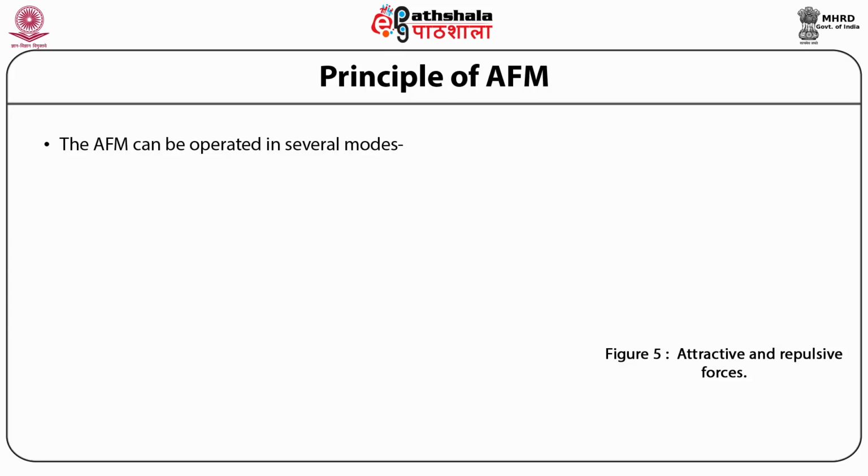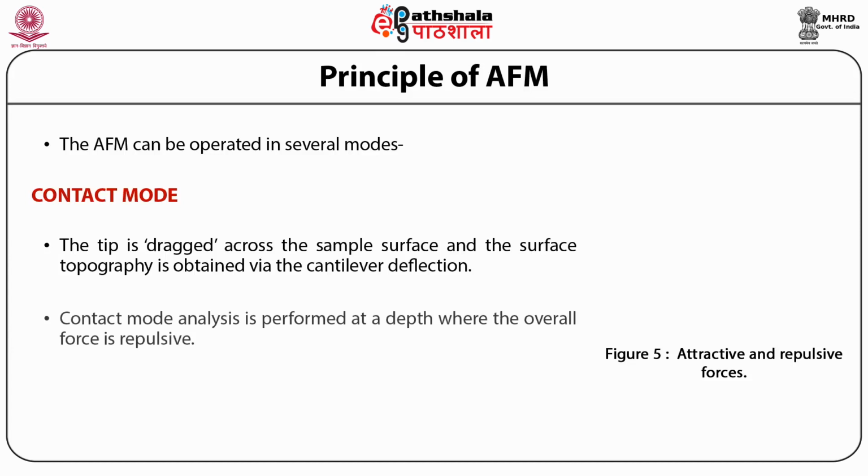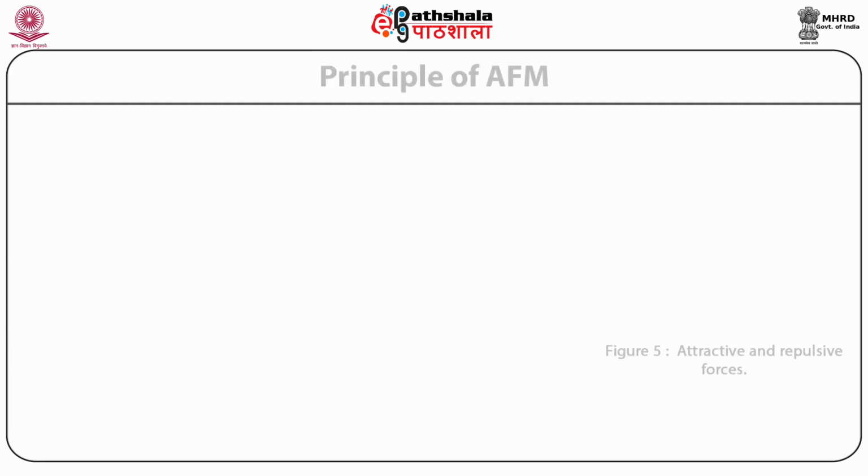The first one is the contact mode. In this mode, the tip is dragged across the sample surface and the surface topography is obtained via the cantilever deflection. The contact mode analysis is performed at a depth where the overall force is repulsive. The attractive and repulsive forces are shown in figure 5.